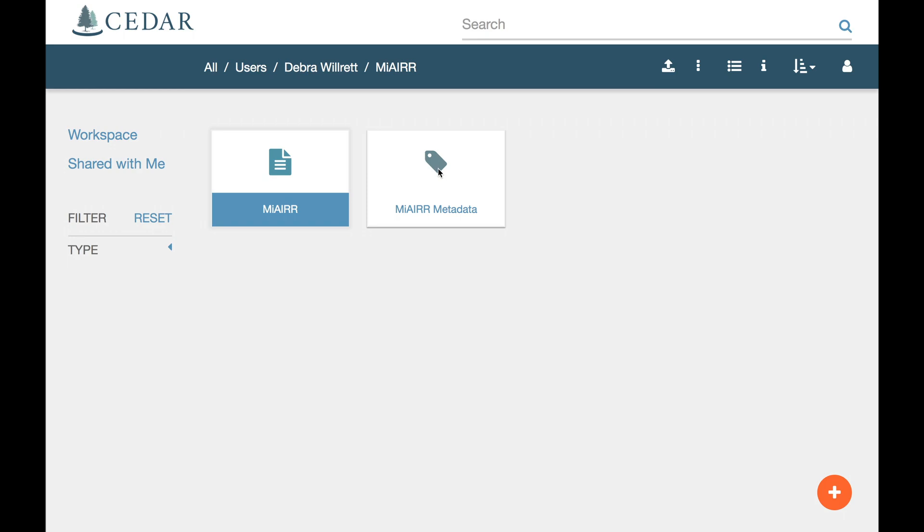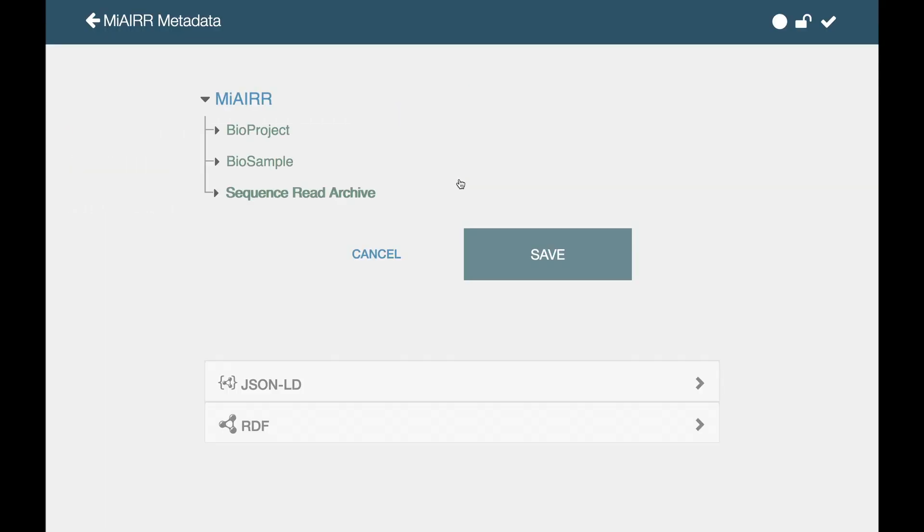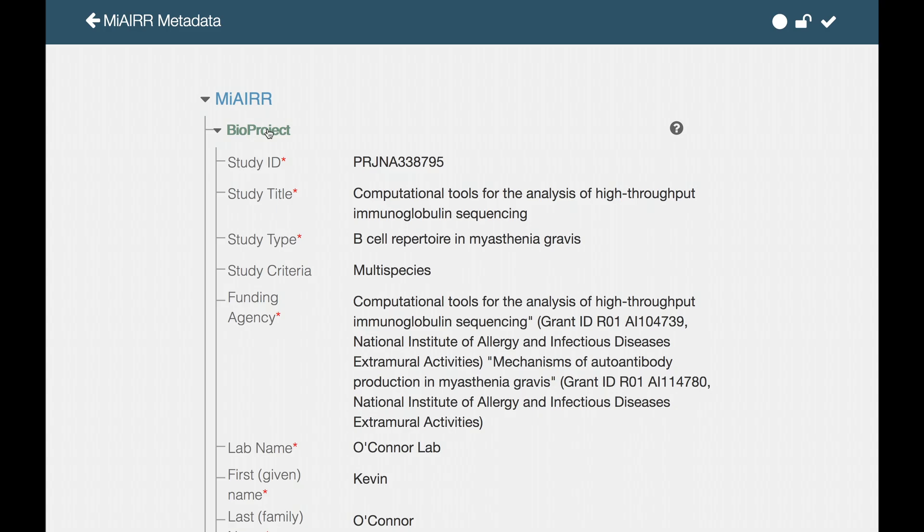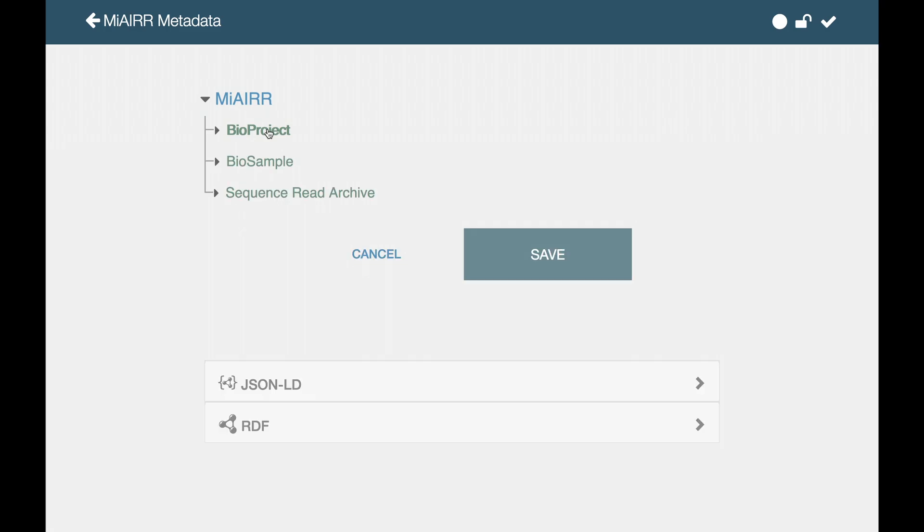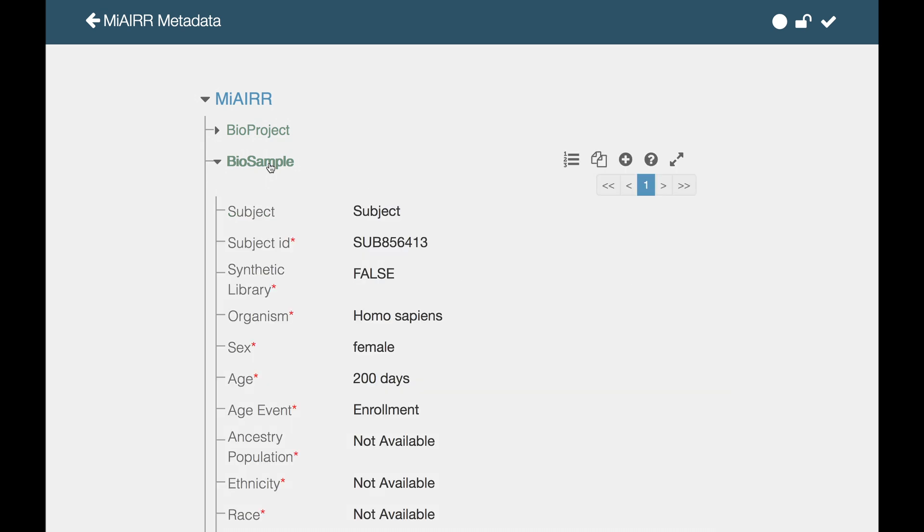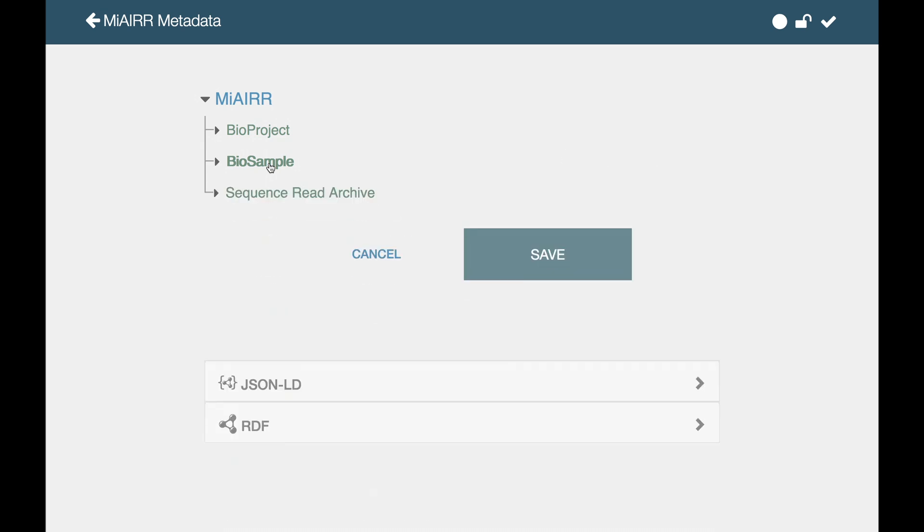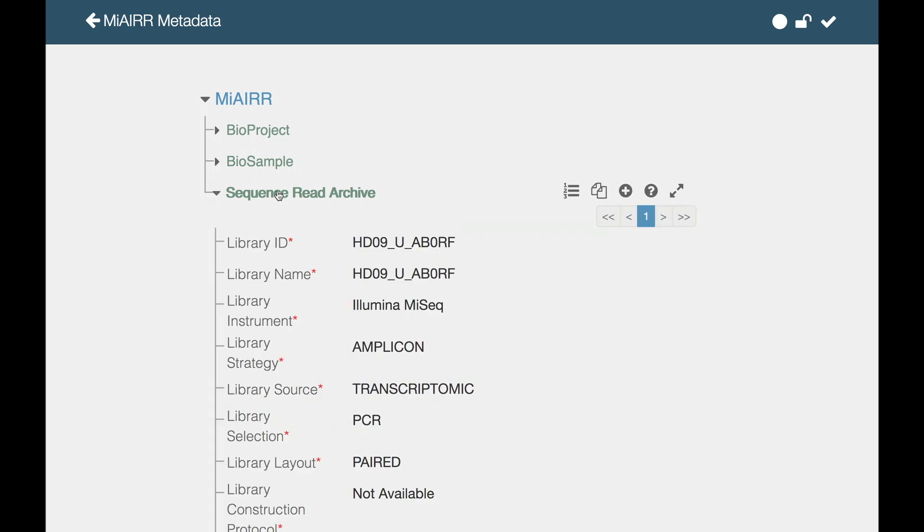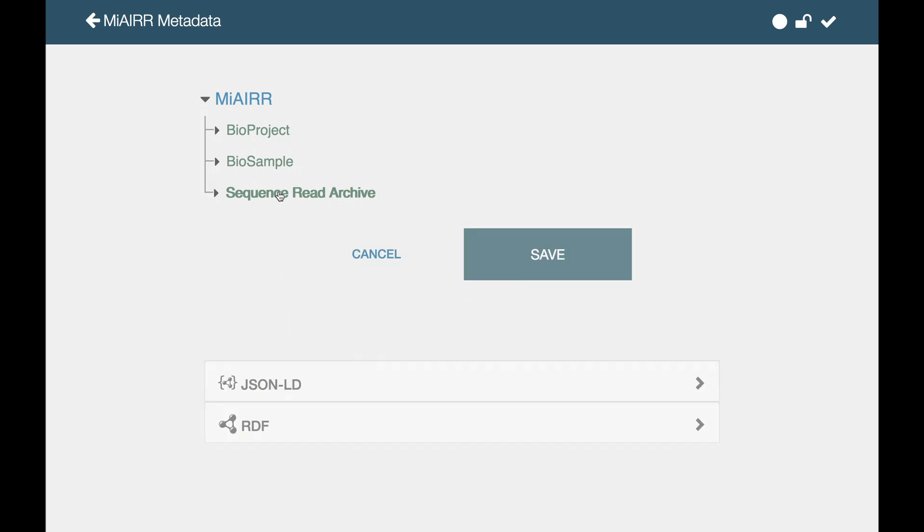The My AIR metadata consists of three elements. The first describes the submitter and study. The second describes each biological sample used in the study. The third contains the parameters and configuration for each experiment. A future version of the template will contain a fourth element for the GenBank metadata.